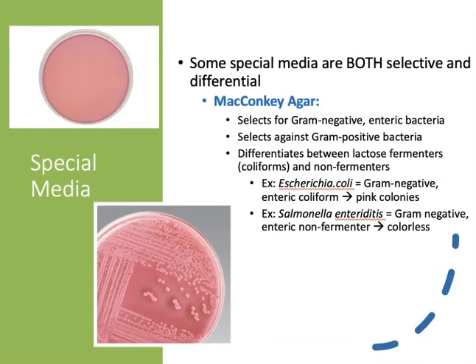Another medium that is both selective and differential is MacConkey agar. If you look at the top of the slide, you can see an uninoculated MacConkey agar plate. It has a very similar pinkish color to mannitol salt agar.